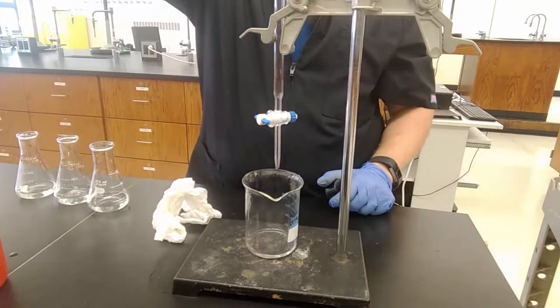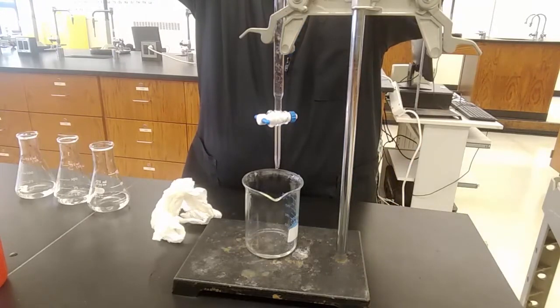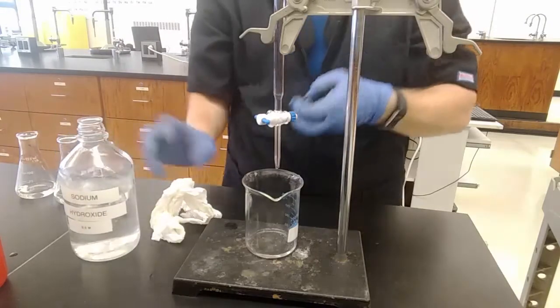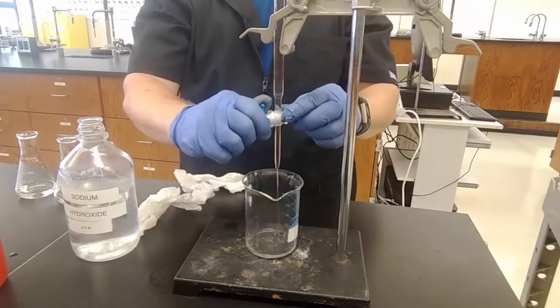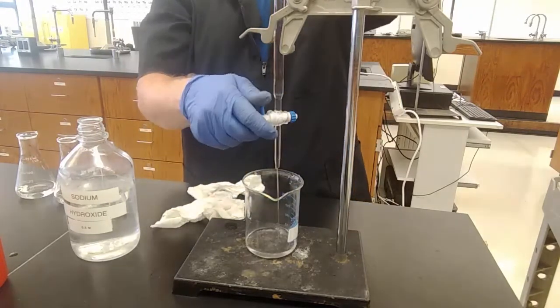Again, I'm going to fill it with base. It says don't waste your time filling it exactly to the zero mark with base because there's no reason for that. I'm getting it where there's no air down in the tip.